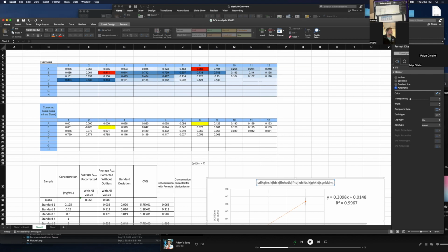Yeah, you haven't deleted that B yet. What B? Go up. B4. We have to delete that. Delete it in your corrected values, not your raw data. Oh, Command Z. And delete it right there. B4. Okay. Now check it out. Oh, there we go. Yeah, there you go. That looks a lot better.